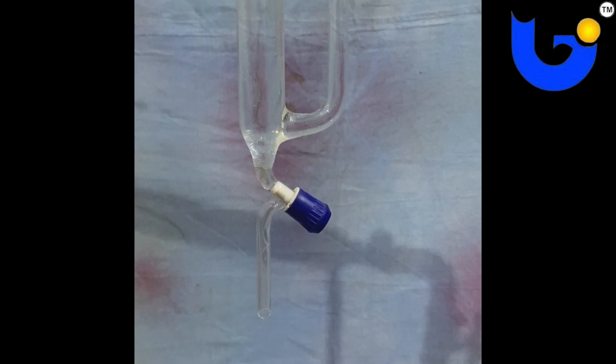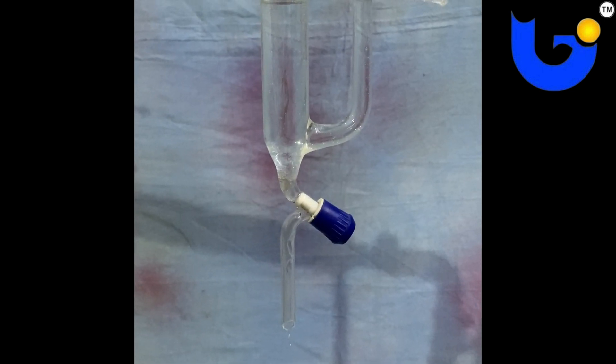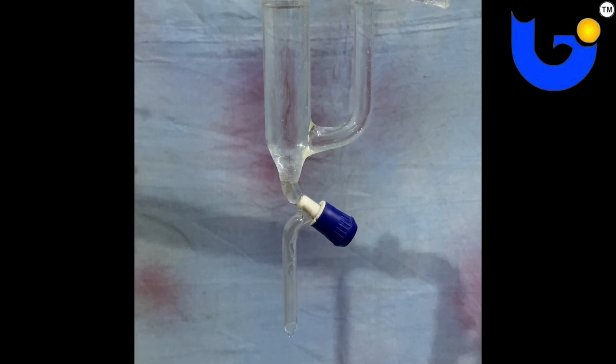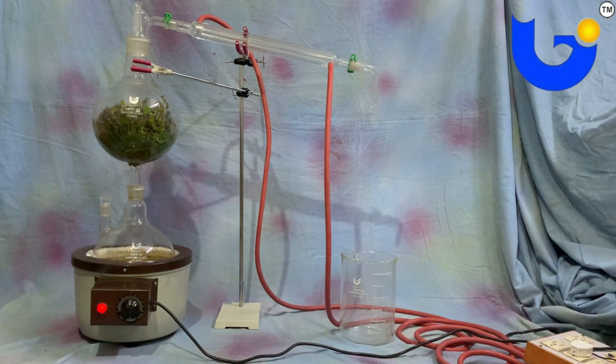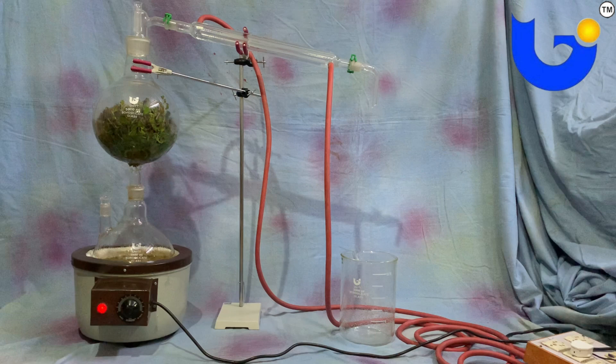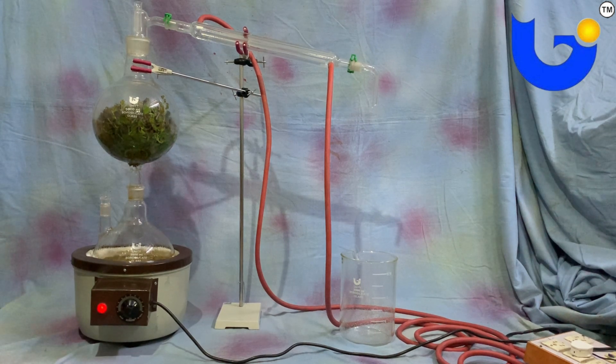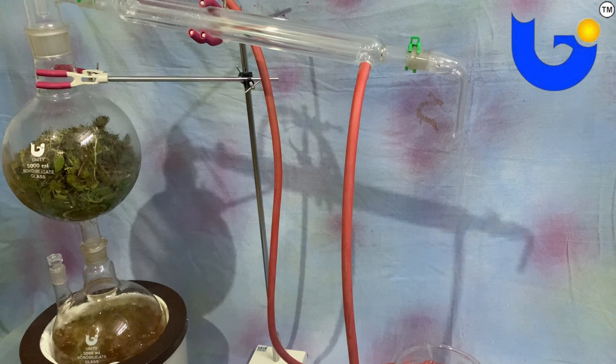The received liquid is a mixture of hydrosol and essential oil. With the help of this funnel, the mixture will separate as any type of oil and water. The hydrosol is a milder form of essential oil which also contains the plant's aroma along with the other parts of the plant that are water-soluble. The oils float towards the top while the water settles below. From there, it's a simple matter of removing the oils that have been separated. These are the highly condensed aromatic oils. And that's how the essential oil is made.